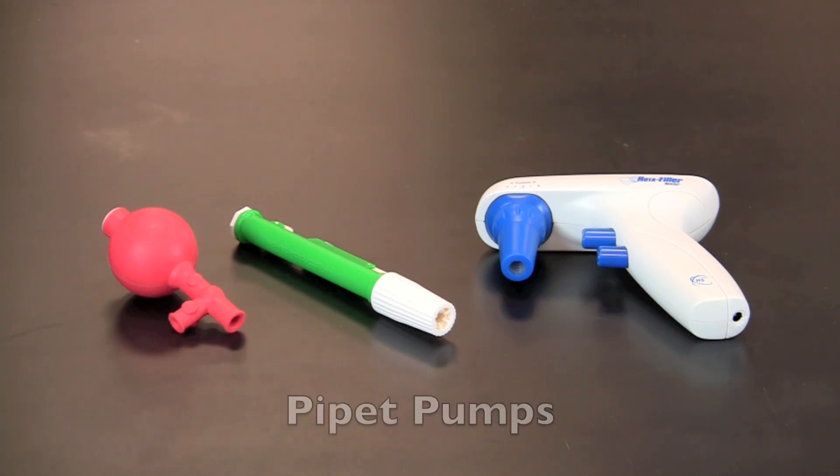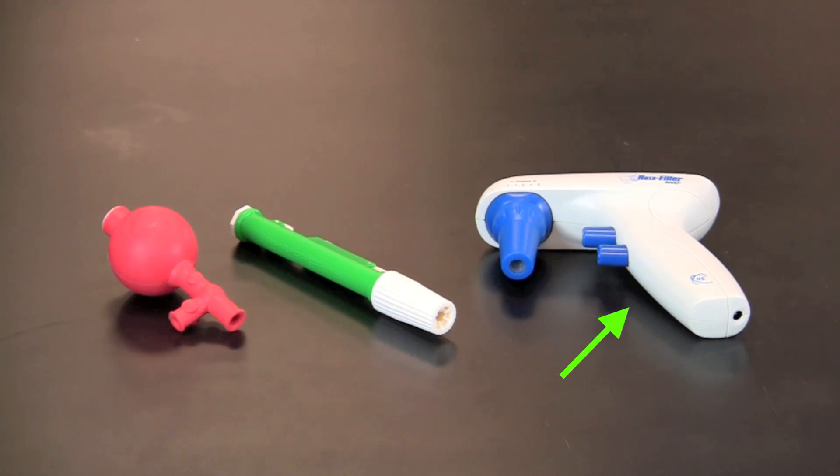Serological pipettes are used with three main types of pipette pumps: the tri-valve, the syringe, and the electronic pump.